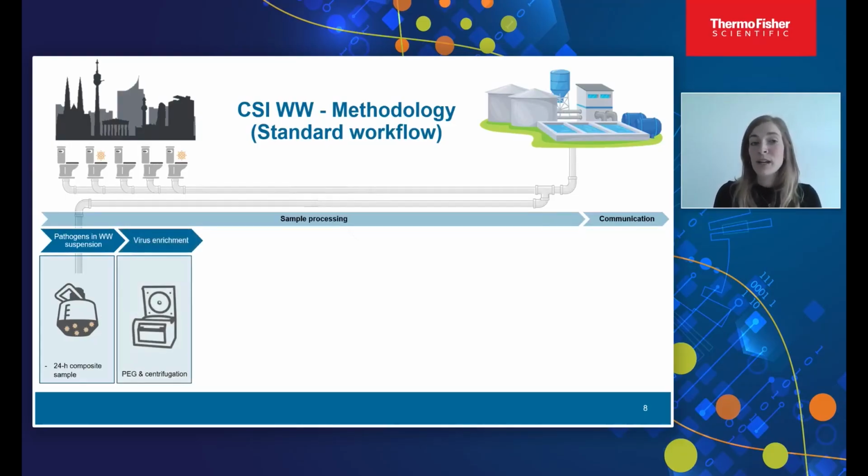After that, we enrich the virus. We use a PEG precipitation method, which is a very commonly used method for virus enrichment, and it also includes very extensive centrifugation steps.